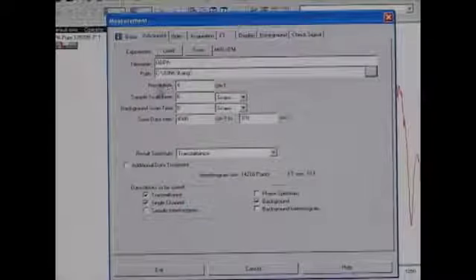Then we move on to the resolution box, which we want to have at 4 centimeters inverse. The sample scan time is normally run at 16 scans. And the background scan time should be the same or higher than the sample scan time. Then we go to the Save Data box, and it's the range of the spectrum that you want to scan.